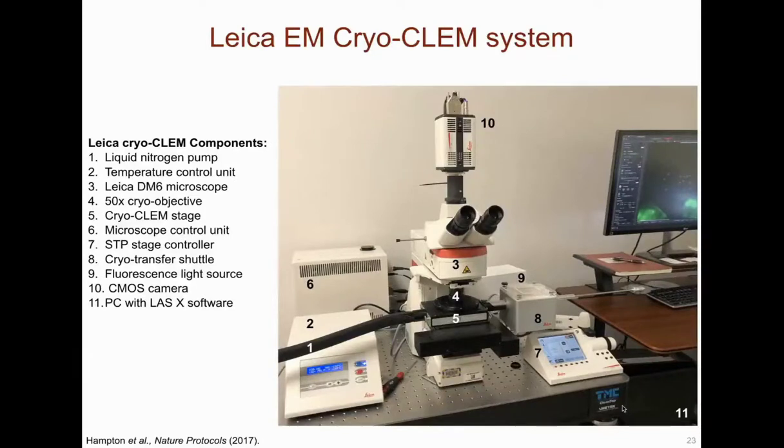So, now that you have prepared your sample, imaged it by light microscopy, and vitrified it by plunge freezing or high-pressure freezing, it is time for cryofluorescence imaging. There are many options available for use. The selection of the system depends on the attributes of the particular system as well as the biological targets. We decided upon a system that is part of a seamless workflow, has minimal transfer steps between systems, and methods for handling that eliminate possible sample damage, as well as an imaging and coordinate data housekeeping system that allows for rapid correlation.